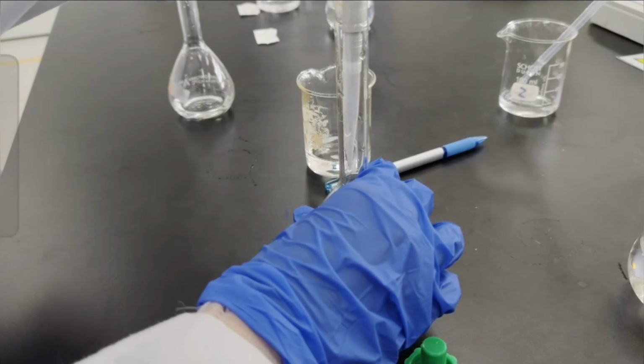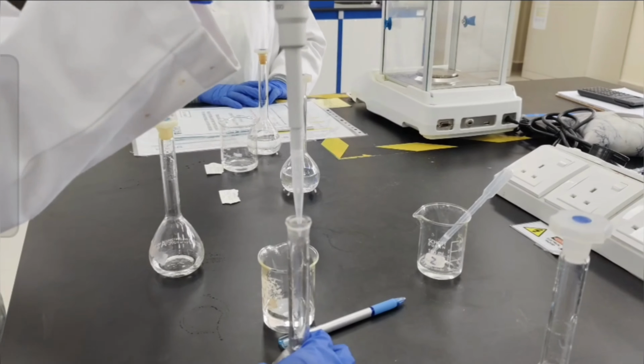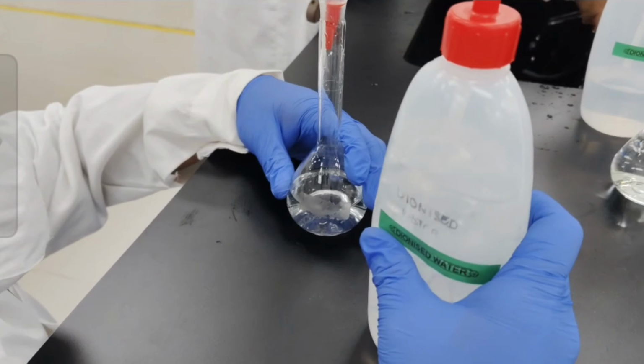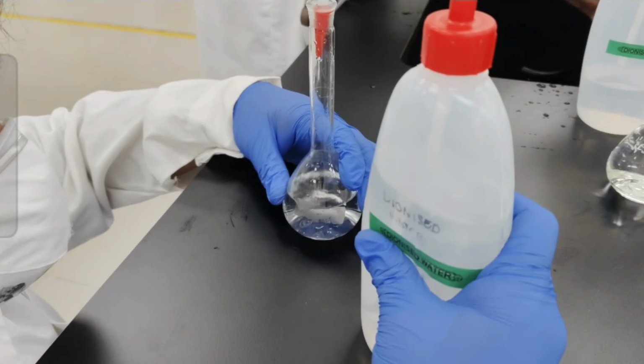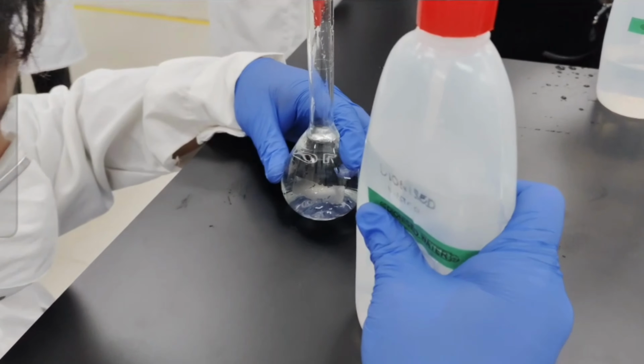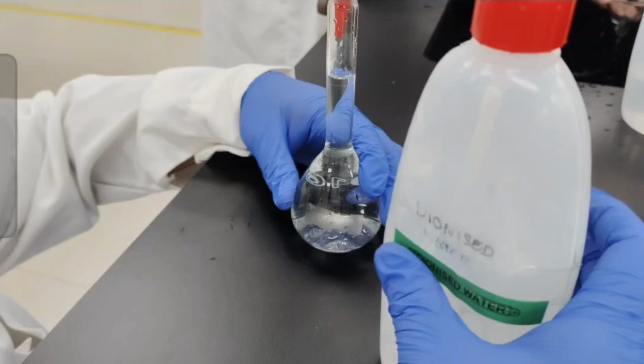First, we transfer a known volume of Na stock solution to a volumetric flask using a clean pipette, with the volumetric flask already filled with some deionized water beforehand. Then we fill it with deionized water until the mark is reached on the volumetric flask. We transferred 2 milliliters of Na stock solution to the 100 milliliter volumetric flask, and then filled it with deionized water until it reached the mark.